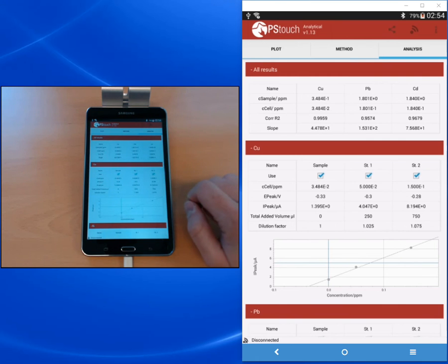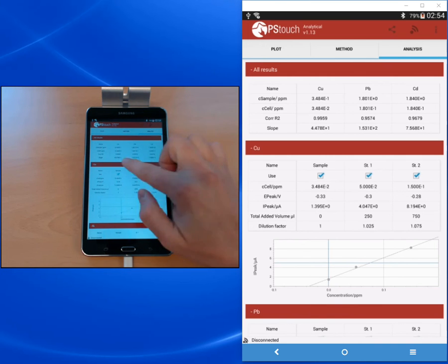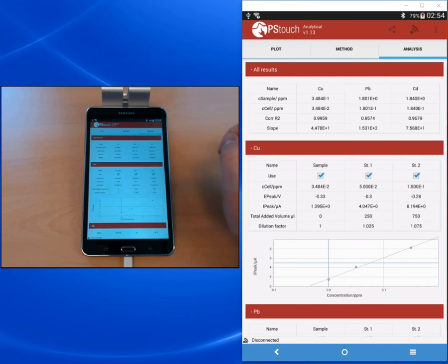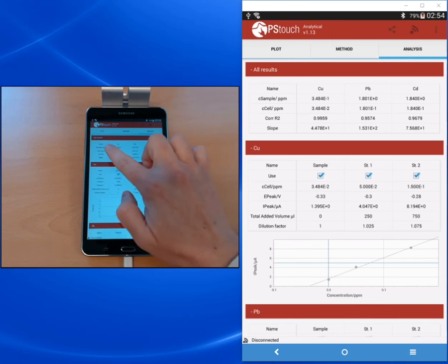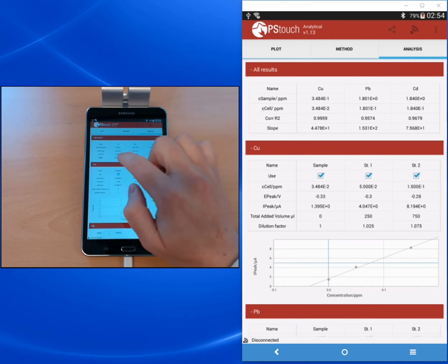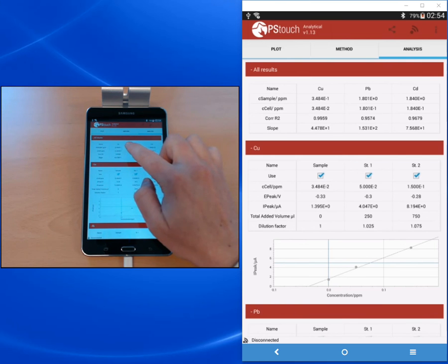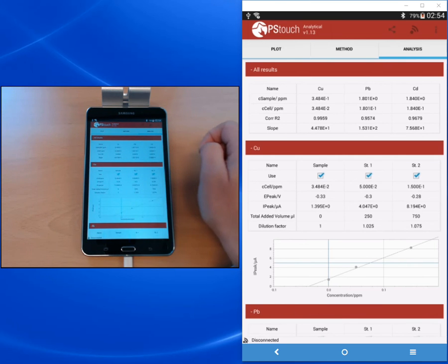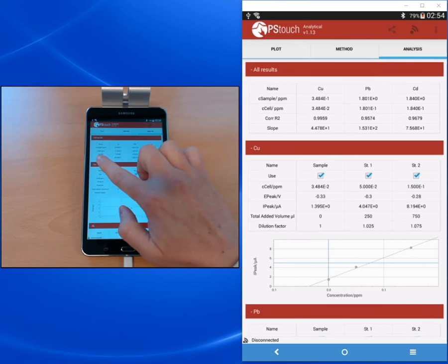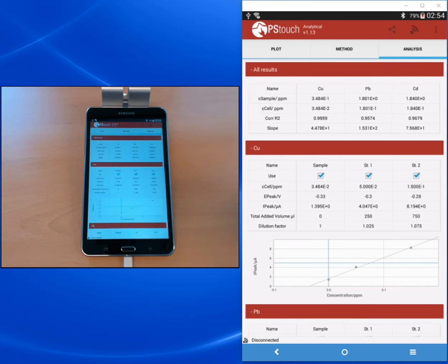Once you've entered all these parameters, we can go to the analysis tab and there you will see all your results. On the top you see a summary of all results with the most important values: the concentration in the sample, the concentration in the cell, the correlation factor, and the slope. With the concentration in the cell you see here again our dilution factor of 10. The concentration in the cell is 10 times lower than the one in the sample that has been calculated.